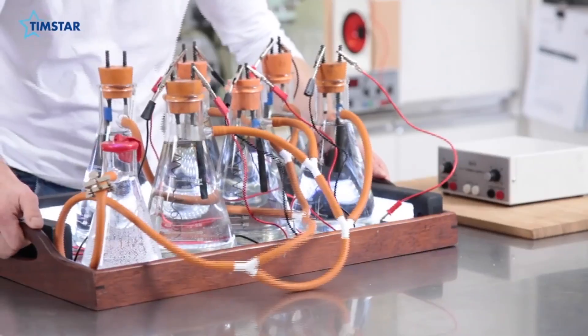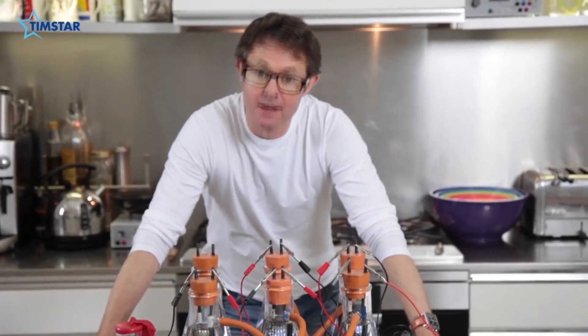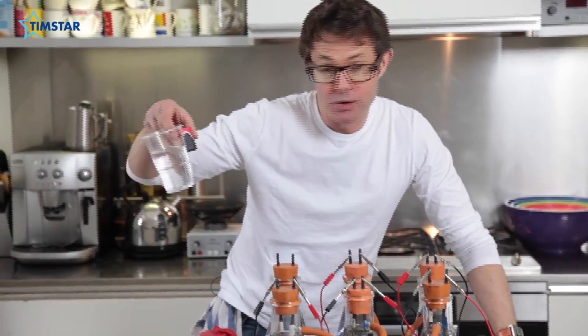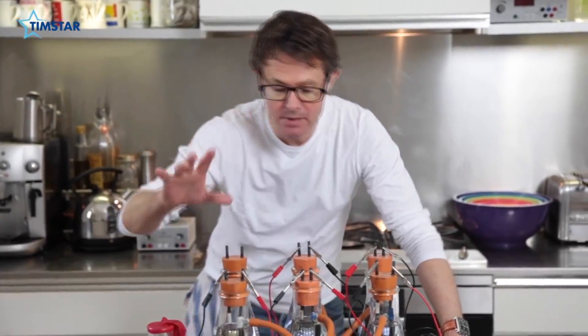The only way to make this really exciting is to do it on a bigger scale. Meet Ethel — a large-scale electrolysis demo. It's exactly the same principle as the battery and the drawing pins and the cup, but on a huge scale. Let me show you around.